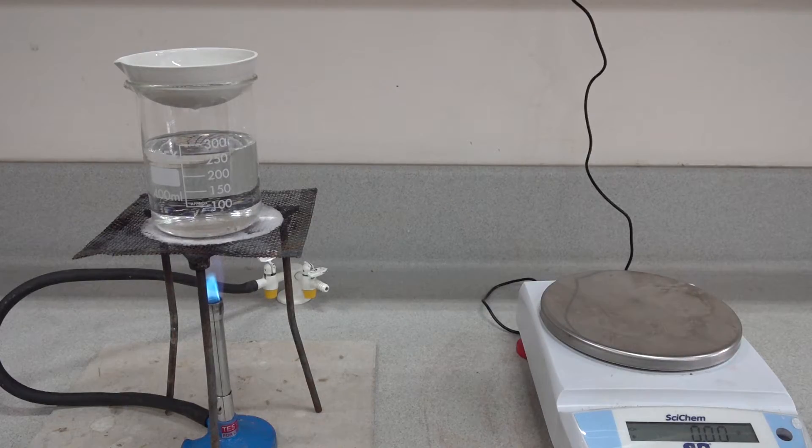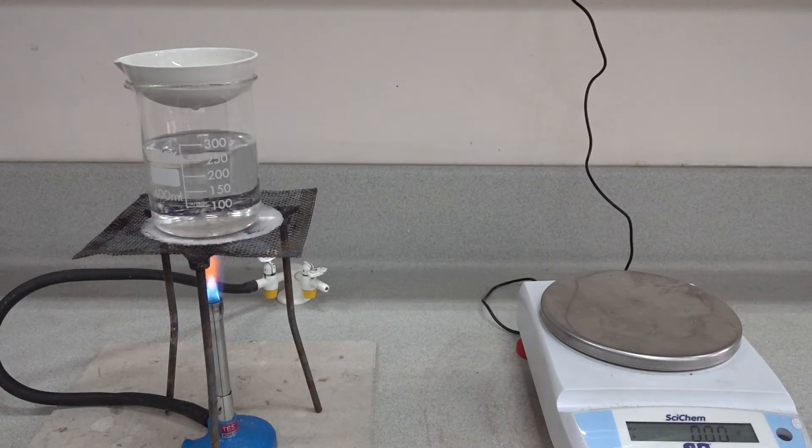As you can observe, the water bath is just starting to boil and we'll need to reduce the heat slightly, closing the air hole on the Bunsen burner for a more gentle heating.